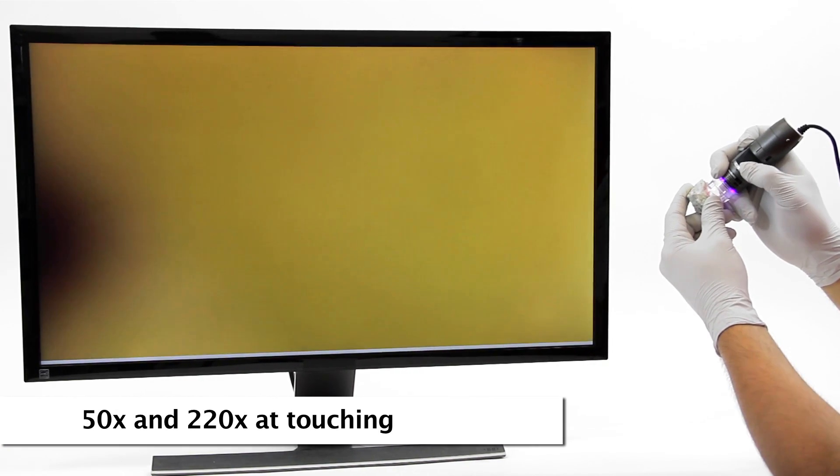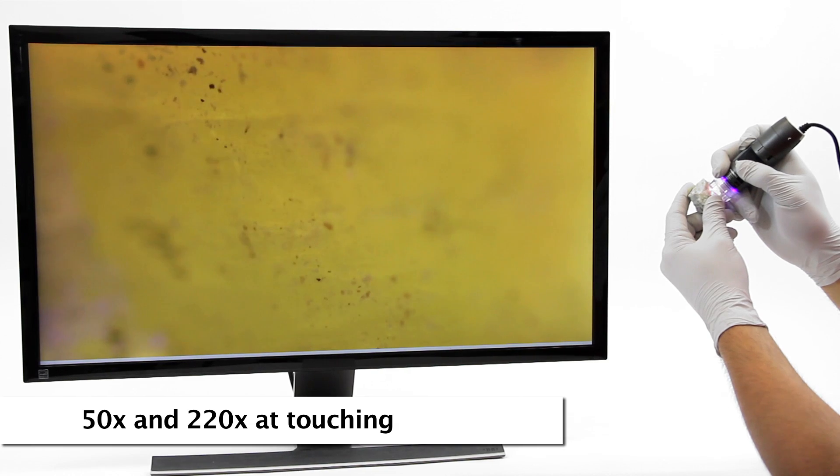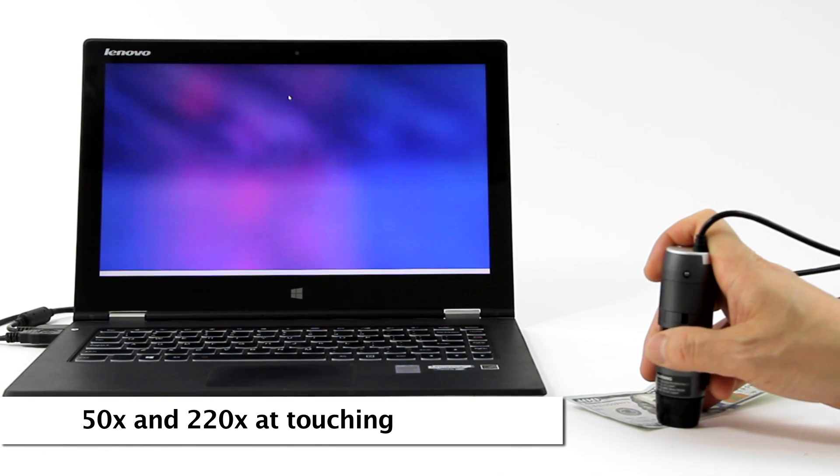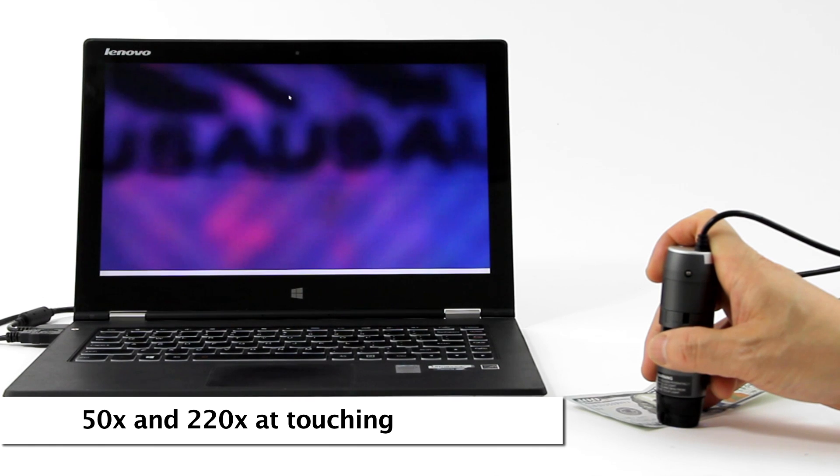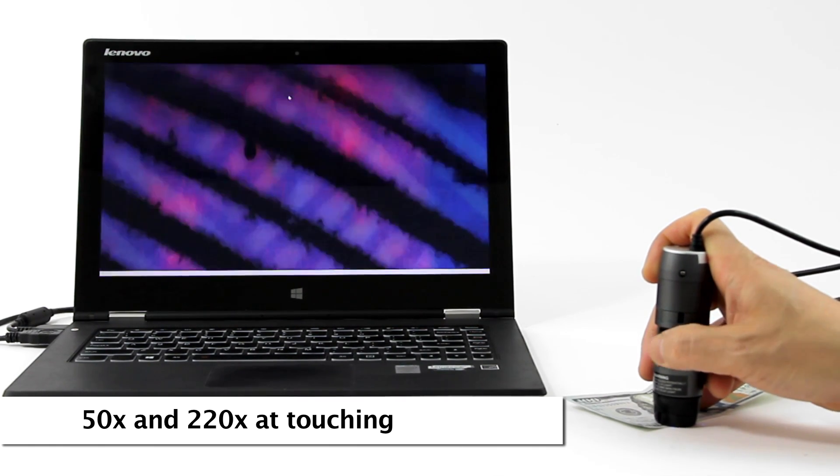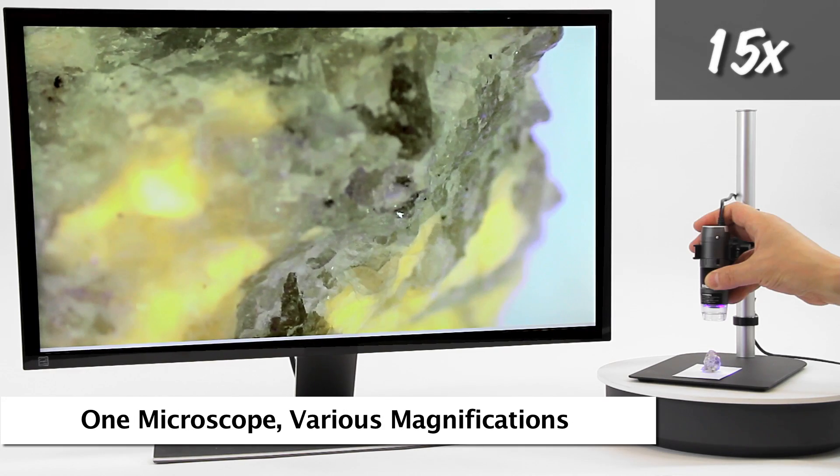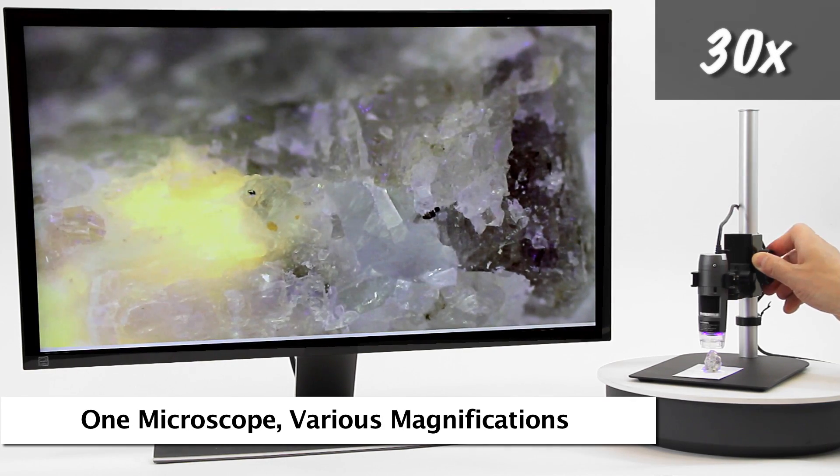Standard Dynolite working distance allows for 50 times and 220 times magnification when the end of the Dynolite nozzle is in contact with the object being viewed. These are examples of the standard working distance and corresponding magnification.